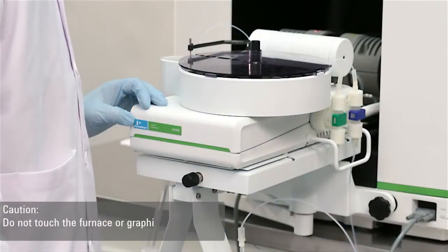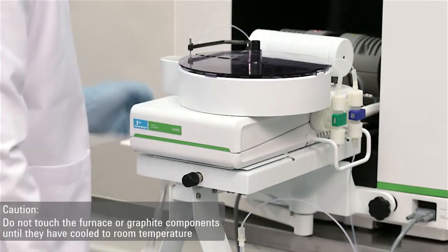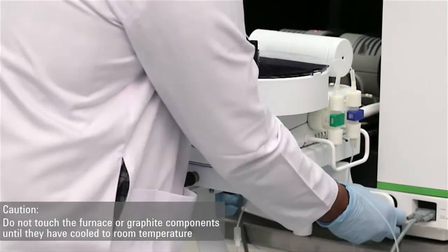Before we replace the graphite tube, we need to clear the auto sampler. Release the left and right locking knobs and swing the auto sampler away.